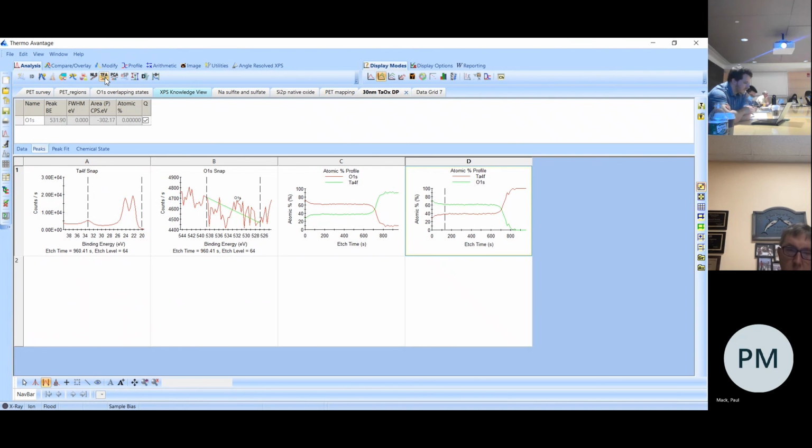And within the peak fit table, there actually is another button that says flow the constraints through all levels. Essentially, it can get very tricky, because you'll have to have constraints that will work for the beginning and the end. Sometimes that's very tricky, so that takes a lot of pre-thought and seeing how it flows through. And then clicking the fit all button for the computer to do a fit for every single spectrum. That's a fun day.